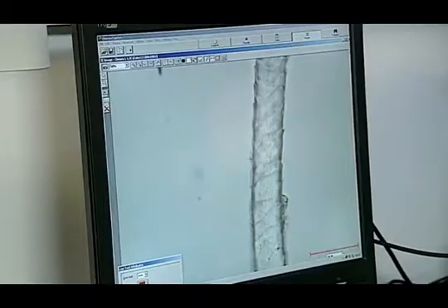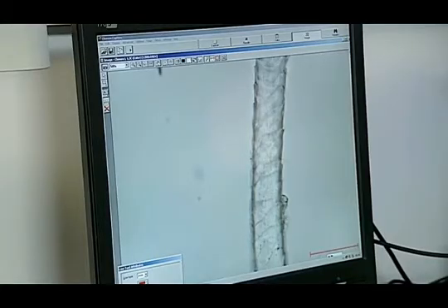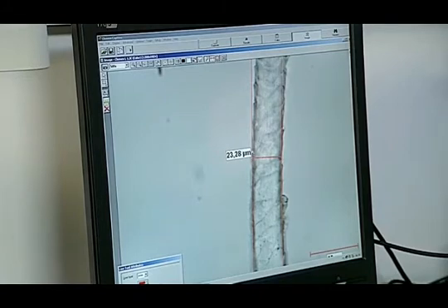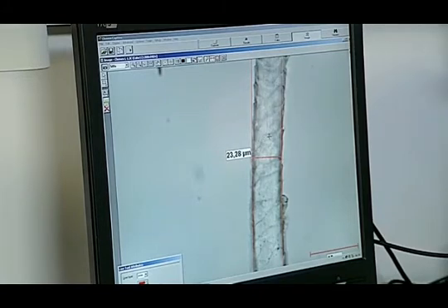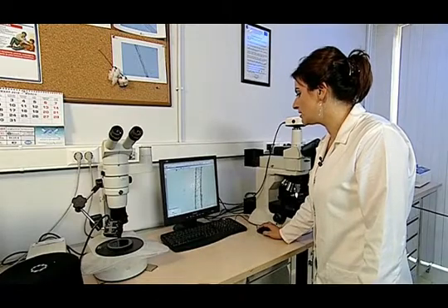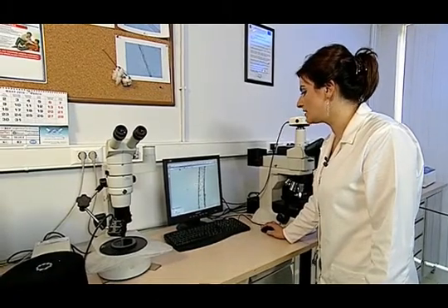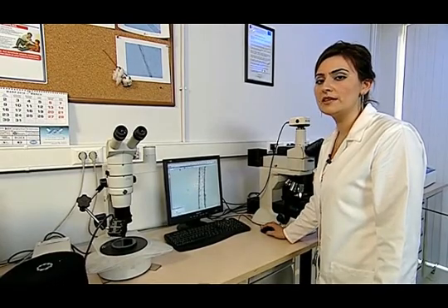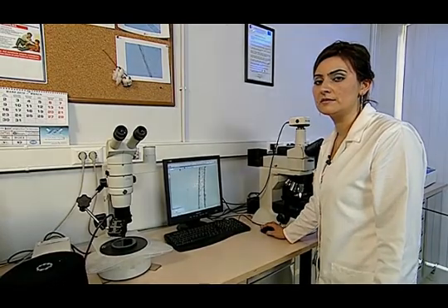After measuring from one side to the other, we take a cross section from the fiber. The diameter of the wool is measured in microns. We give the test result as the arithmetical mean of at least 50 samples measured in this way. The arithmetic mean of at least 50 samples is taken as the result of the test.